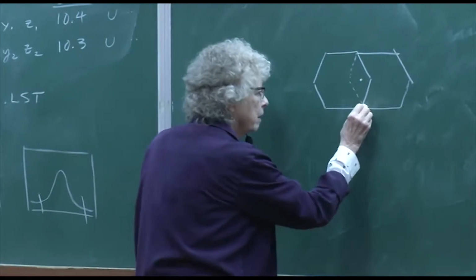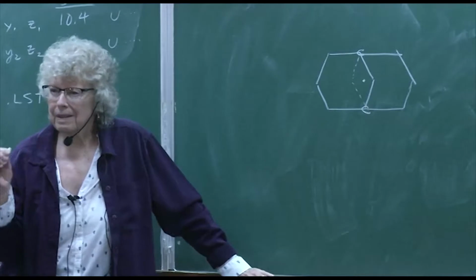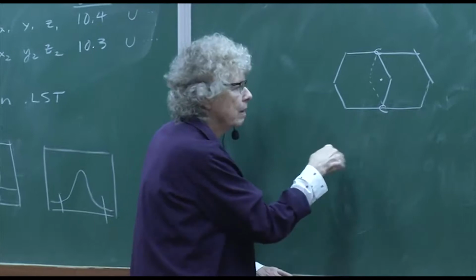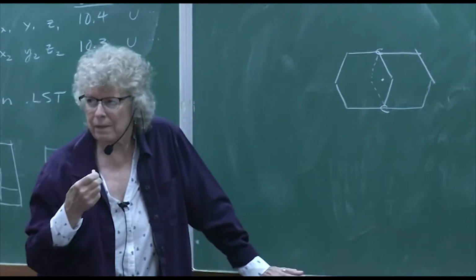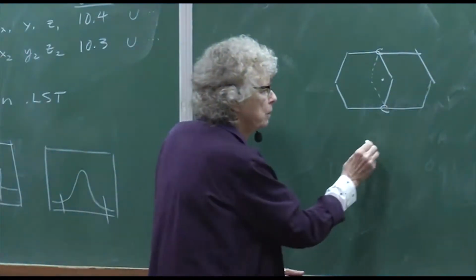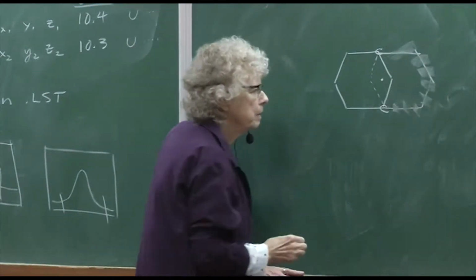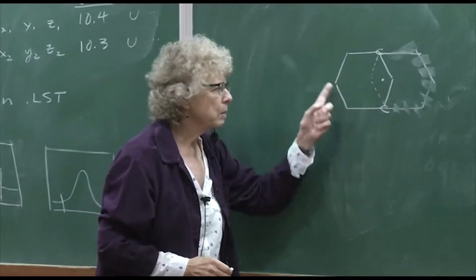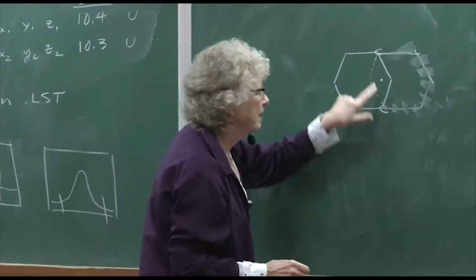So actually, this carbon and this carbon are used on both molecules, so those should have a site occupation factor of 1. But the rest of them are all not being shared, and so they should all have site occupation factors of 0.5. But in your file, you don't need to count these because they're generated by symmetry. All you have to do is count these that make one molecule and then set these to, I'm sorry, I said it backwards. These are at 0.5.